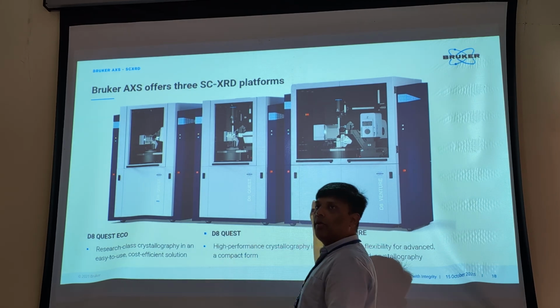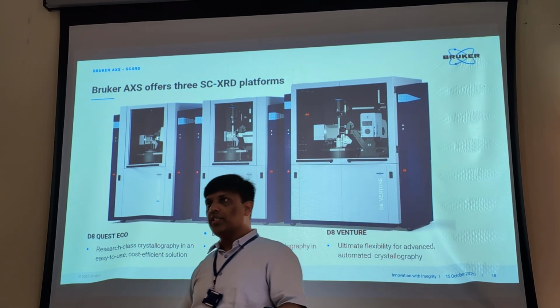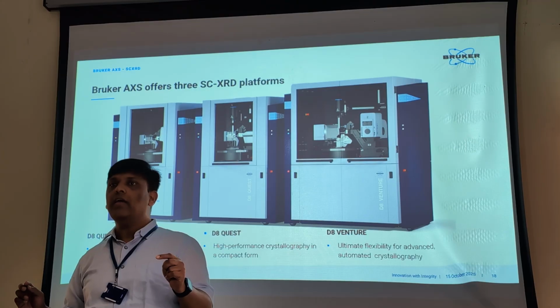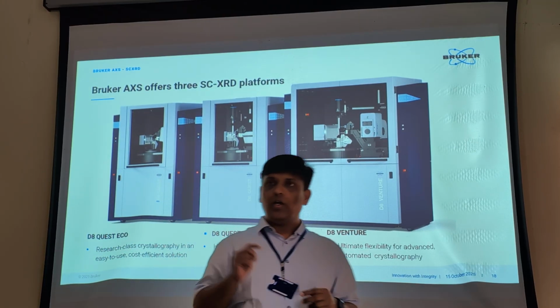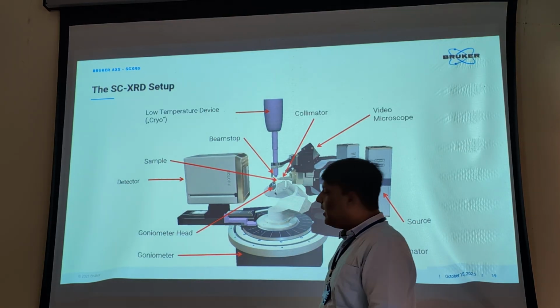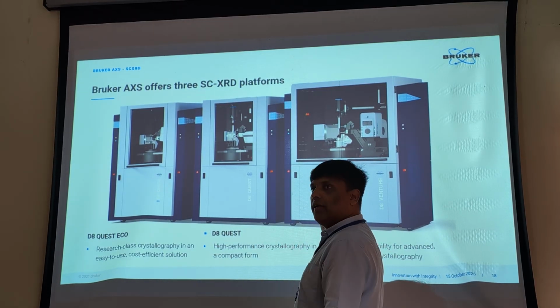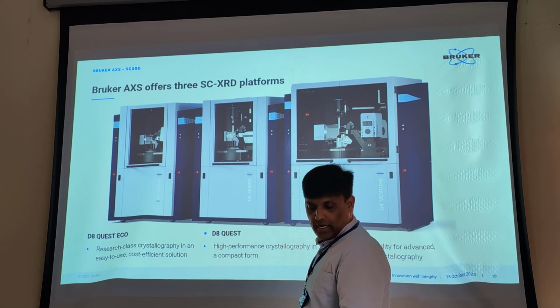This is the instrument you have here at IHBT, one of the top-end machines, with two independent X-ray sources. Why do we have two X-ray sources and not only one? You have both molybdenum and copper. I'll come to that. If you look at the inner beam of this diffractometer, you can see we don't do anything here. Our working stage is only the transparent area you can see there. That's the working area.